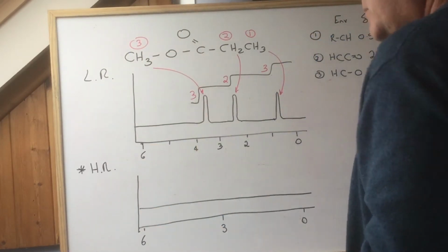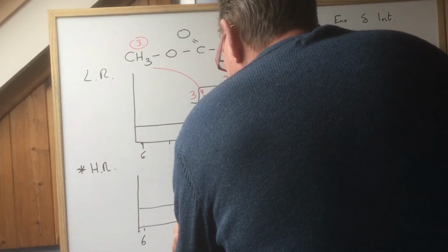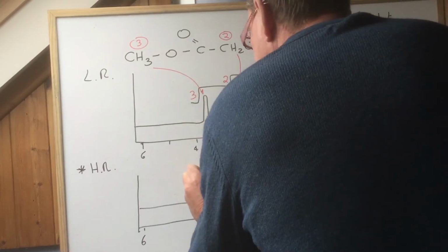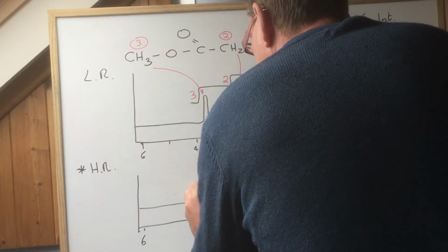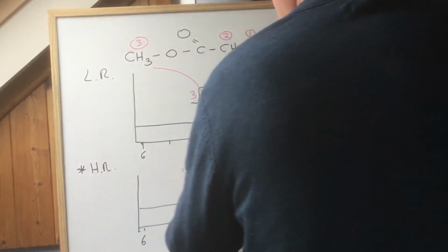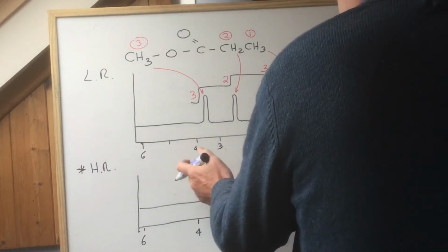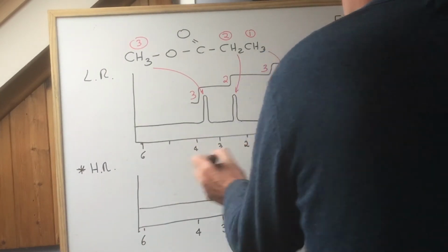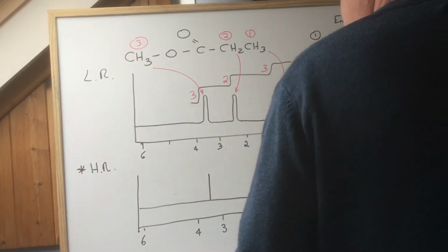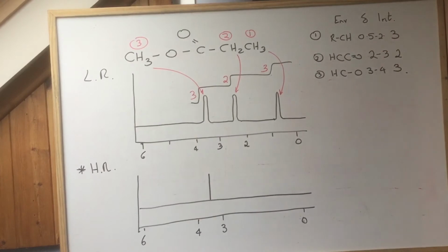So in a real NMR spectrum, you would see, rather than a fatty sort of thing, a thin line, unsplit. And that line will correspond to those 3 there. The integration peak will be overlaid on top to tell you the relative areas and how many are in there, but you get a thin line, not a fat thing like that.